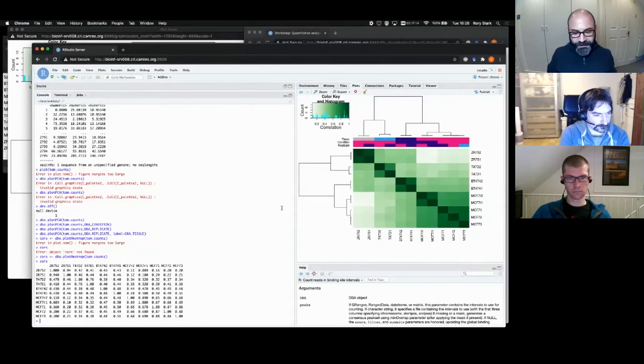and we check the distribution of correlation scores so that the replicate should be more highly correlated than non-replicates. That's it. It's a very simple check, but it usually flags something in a pipeline context. Obviously we generate reports and look at them as well.